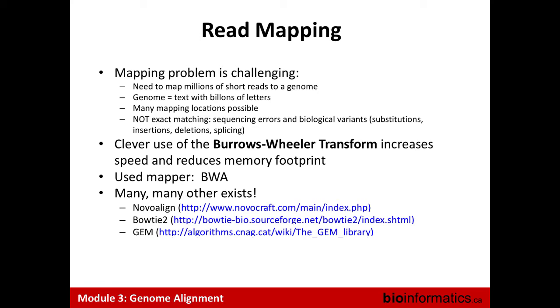What you want to do is to find, in your specific sample or in your set of specific samples, what are the characteristics of these samples? So you want to allow the individual variation to be included in your alignment, to be able to compare this variation with the reference or this variation between your samples. So you don't want to have perfect matching.